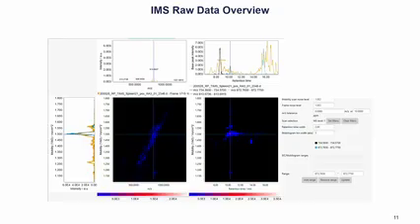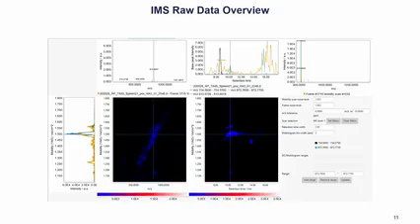And if you select a point in that ion mobility trace, then you can show the mass spectrum at that point, which is the individual mobility scan. So this is not a frame, but this is within the frame, the individual mobility scan. And of course, you can iterate and go through these scans. So as you can see, this is quite complex. And this is just still looking at the data. But MZmine now has all these options, and they're all interactive. So you can zoom, you can click through them, and it allows you to see the data in all its complexity.